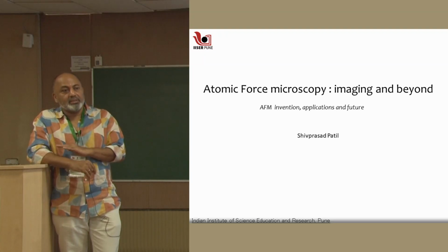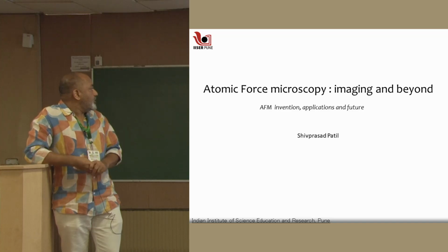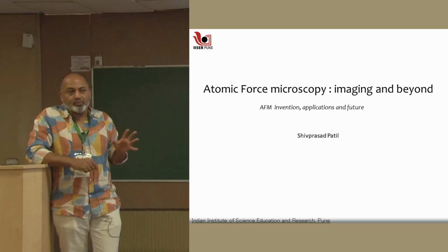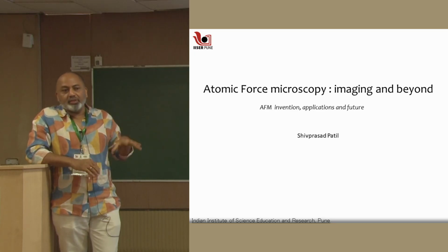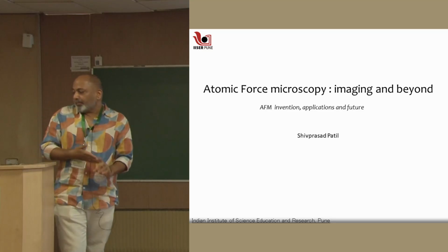So I have titled this AFM Imaging and Beyond: its invention, applications, and, if time permits in today's 3 lectures, we'll also talk about some future in AFM technology, where it is all going.